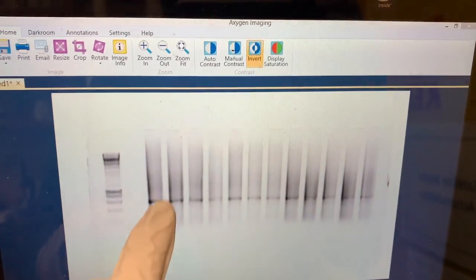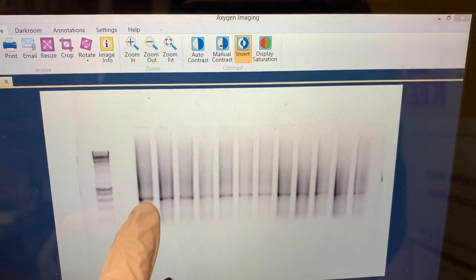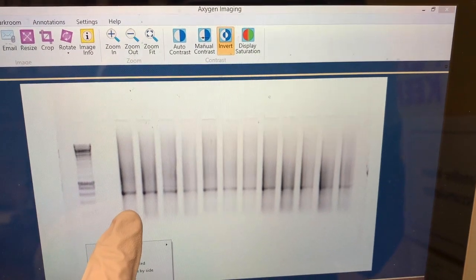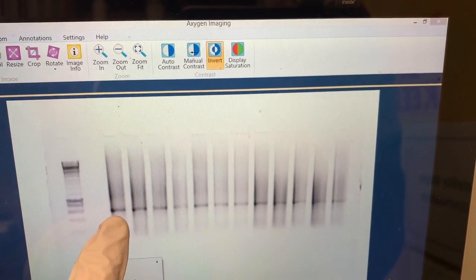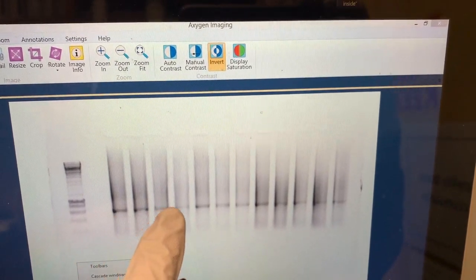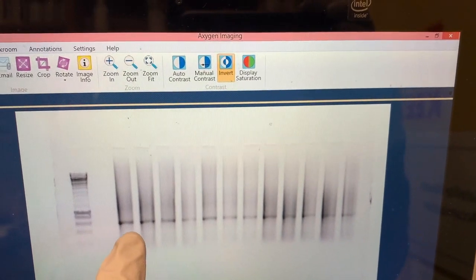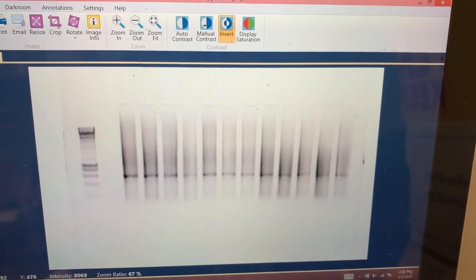So if I decide that my band here is about the same as that, then that means that this band is about 50 nanograms as well, and that since this is a 1 to 10 dilution, this is really 500 nanograms per microliter. You can see this might be less, but I would say maybe these two are about similar. So this is really a way of estimating the concentration that you have.